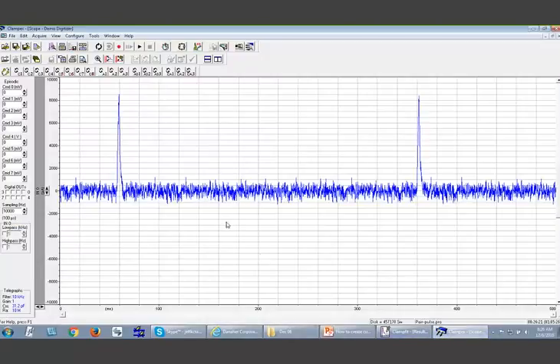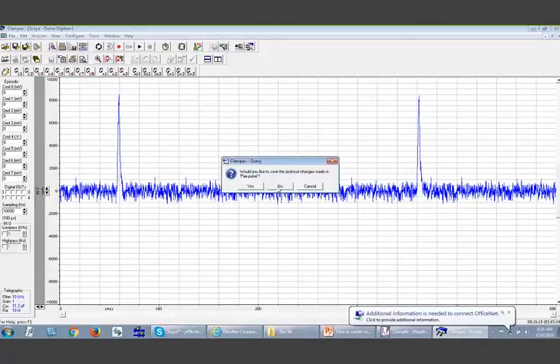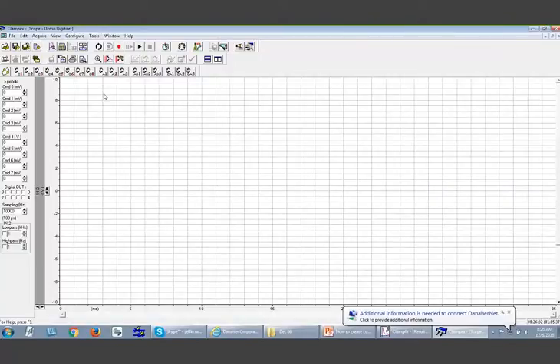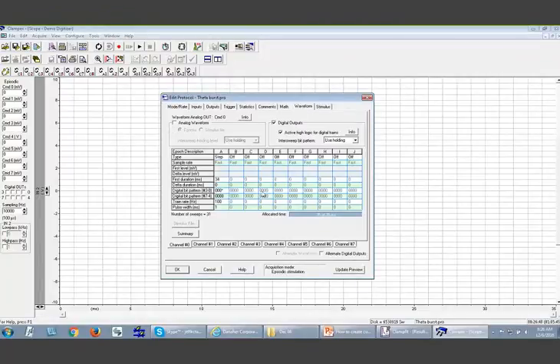Now, let me go back to pCLAMP. I created this theta burst protocol. First of all, I create the 4 pulses. For this protocol, it is for the digital output, because theta burst stimulation protocol has been used to induce LTP in the hippocampus CA1 region. So basically this is digital output to trigger the stimulator that stimulates the fiber.